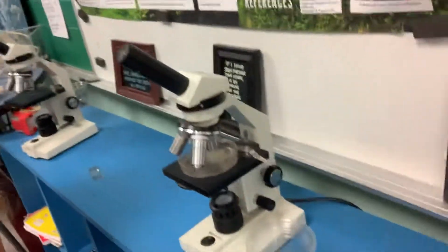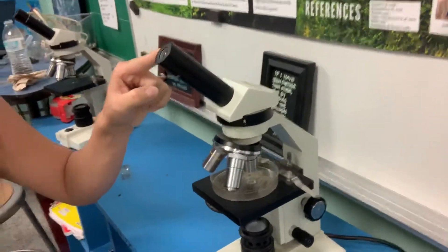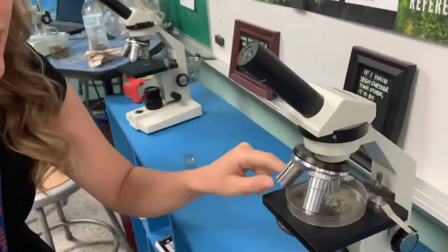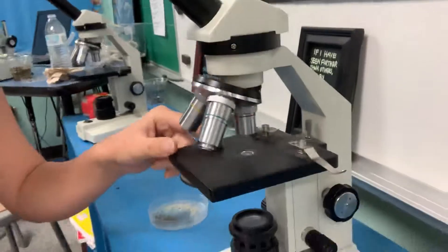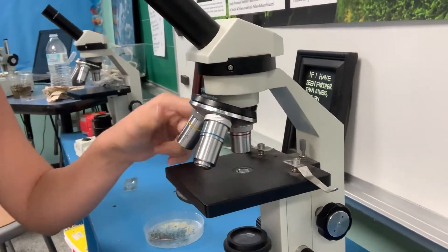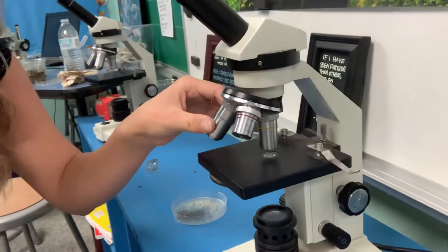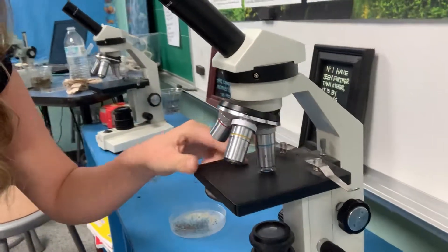If we want to look for a compound scope, this is a compound scope. Notice how there's usually one lens, though sometimes there can be two ocular lenses. Then there's additional lenses down here, but look how much closer the space is. And if we change the microscope lenses down here, we can even get down to that close.